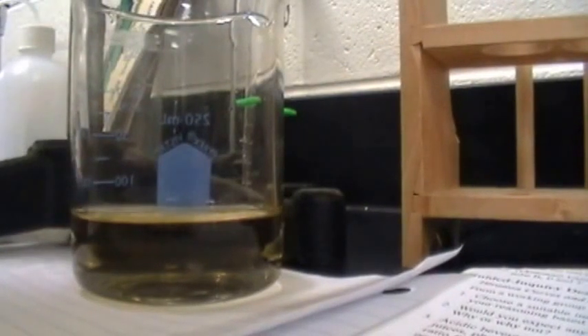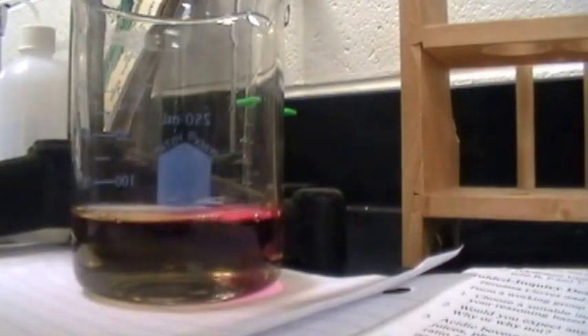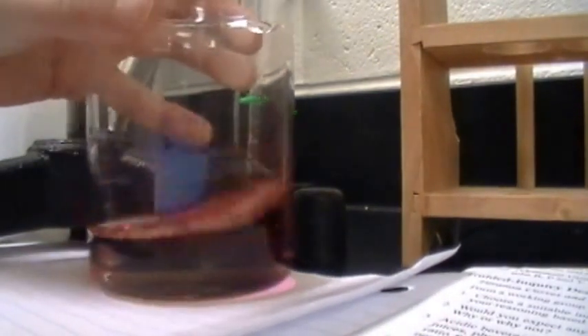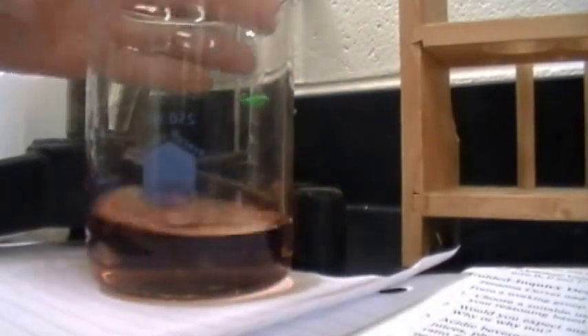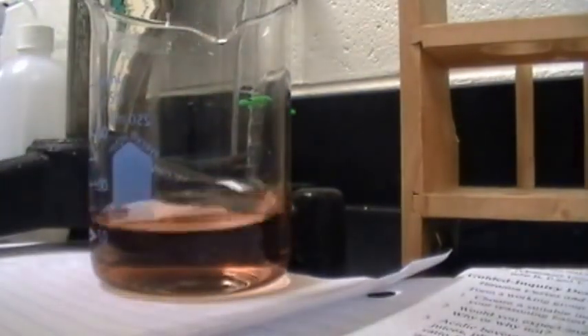Alright, now we're going to add another milliliter of sodium hydroxide. We've turned like a really deep pretty pink. The milliliter before was definitely our color change — so now it's more obvious.